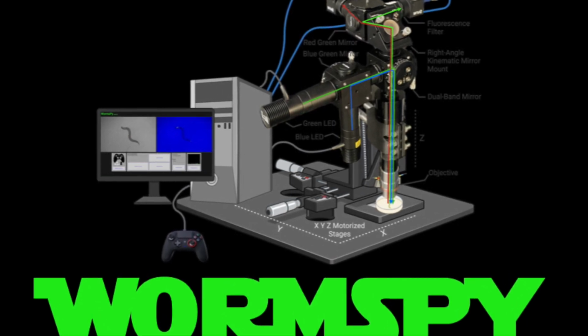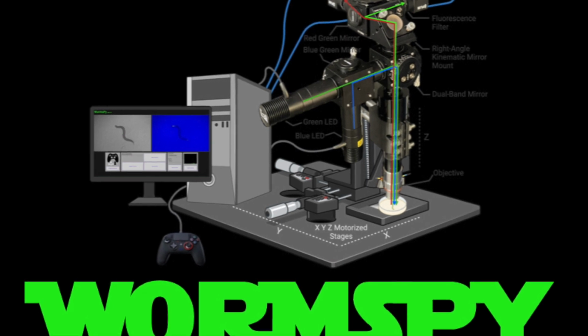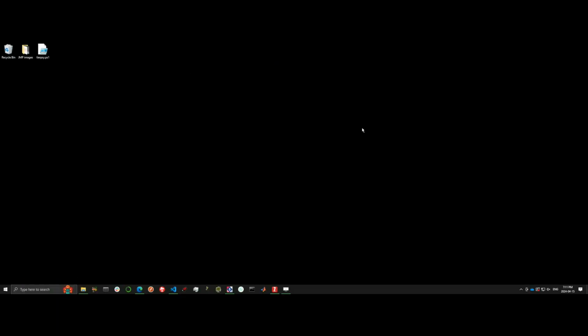Hello and welcome to this tutorial video on WormsPy. So at this point you should have your system set up.